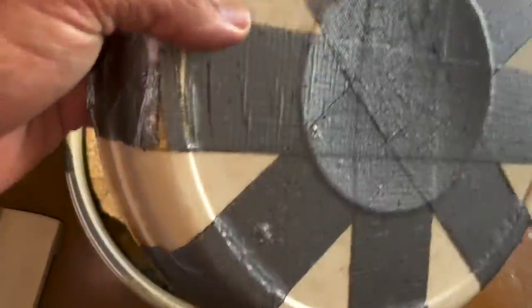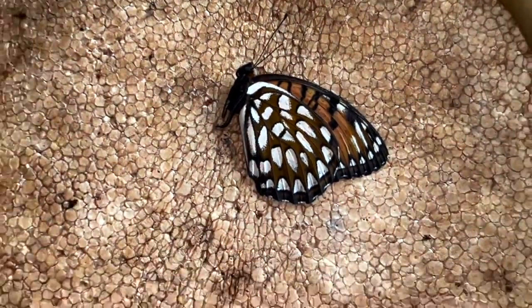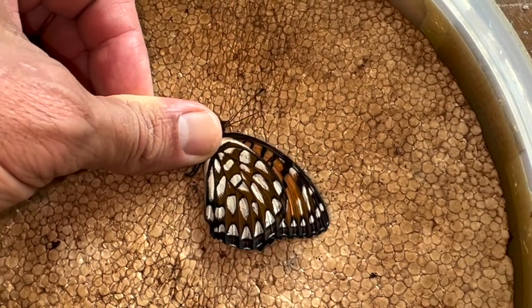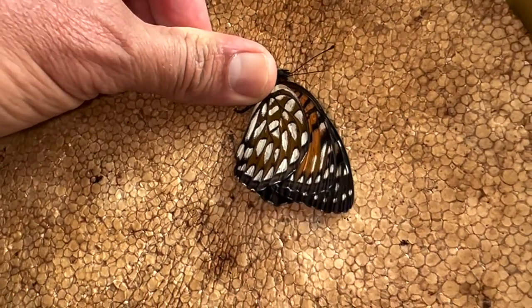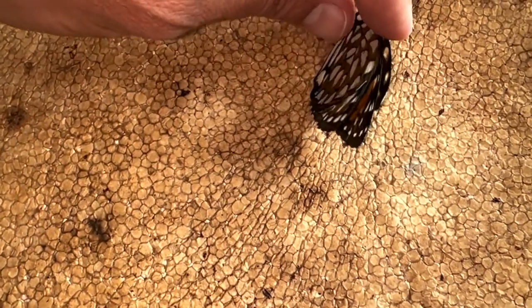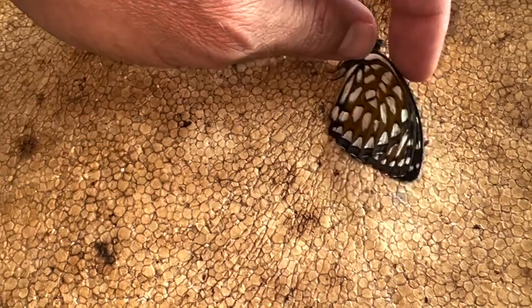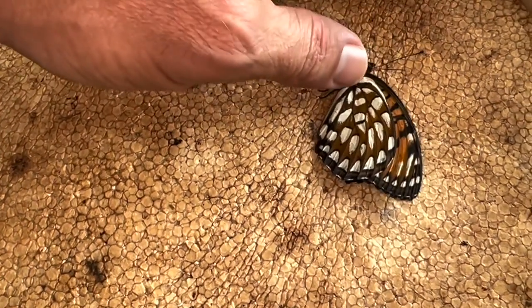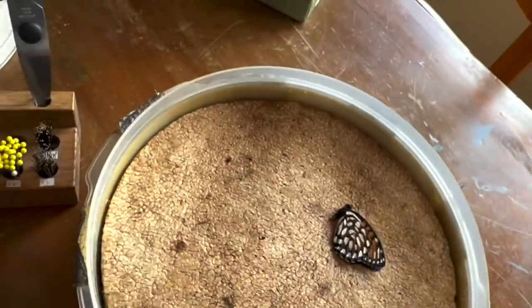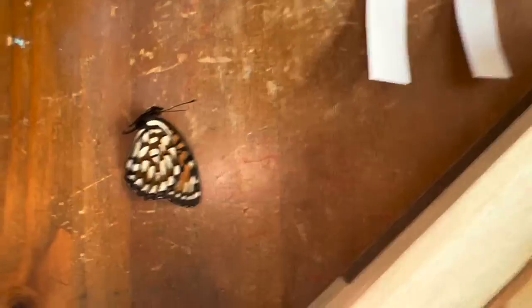Let's open up the container and see how our specimen looks — it looks good. We're looking for the wings to be pliable. This specimen was very dry when it came in the mail and the wings were very stiff — you couldn't move them without breaking. Once they're dry, the butterflies are a little stiff, so we have a little trick on how to loosen up these wings. We're going to handle our butterfly with a pair of forceps and take it out of the rehydration chamber.